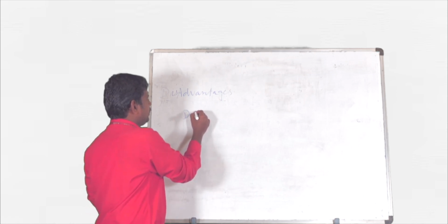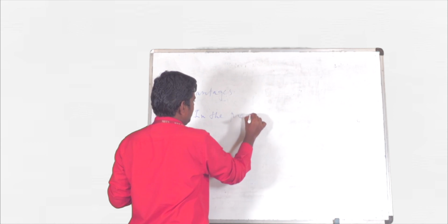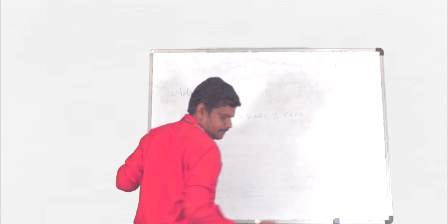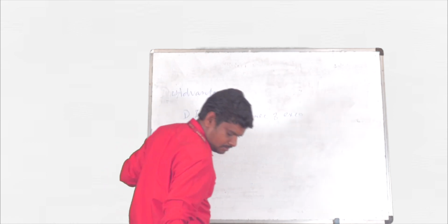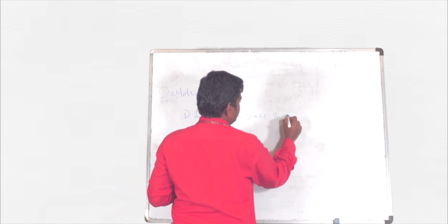So, in the presence of other electrolytes, the result is affected.